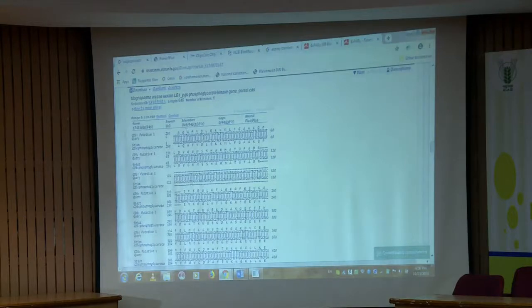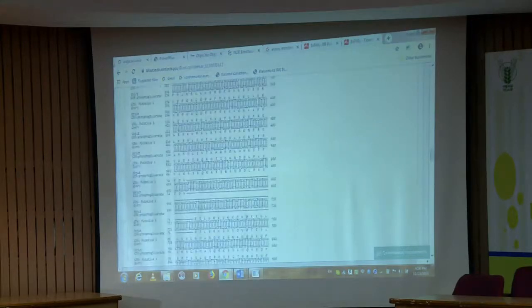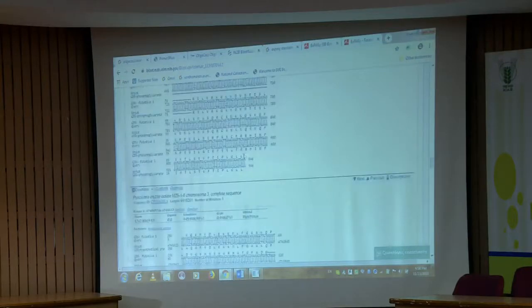See here, it is highlighting clearly from this to this is one CDS, right? Then the next CDS starts from this to this, then the next CDS starts from this to this. So the coordinates you are mentioning should be correct, otherwise a single base will shift everything to a new thing. So you have to be very particular while doing this.